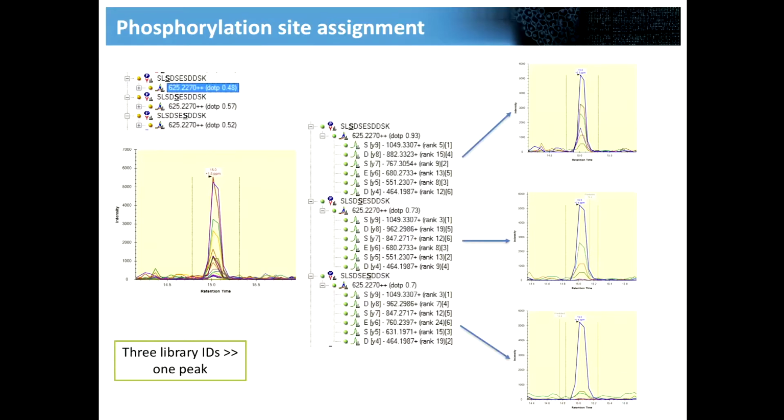So for this localization, for these set of masses, I would have 6 ions that are coeluting. For this localization, I would have 4 ions that are coeluting. Here we have 3, I would say, and maybe I would now deem this localization to be most probable, again, assuming that this P corresponds only to one real phosphosite, and this is not a case of coelution where two different sites coelute together in one peak.